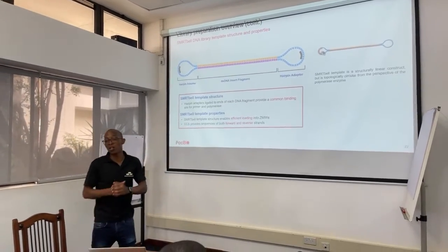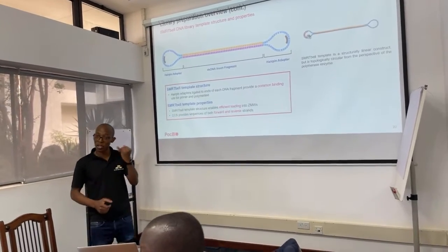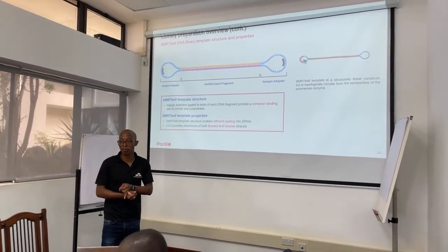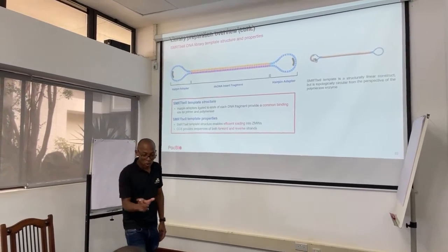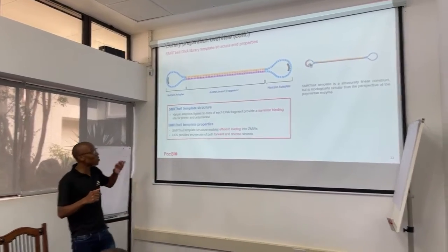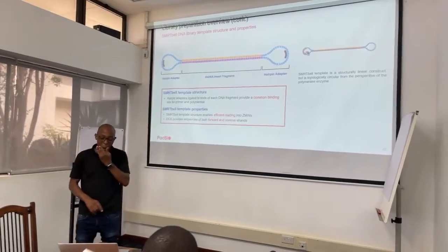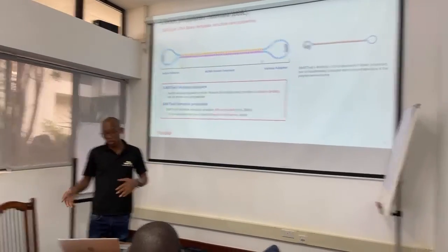And then the next step, once we are happy with our library QC, is what we call two-step: sequencing primer annealing and polymerase binding. Once we have the library, we go into the software. I'll show you. That actually might be problematic. I'm not sure if we'll be able to connect back to the machine back home. But anyway, that step's not going to be done.